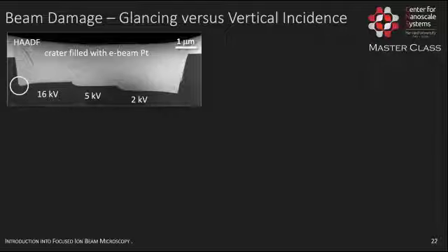Furthermore, you see now a white band closer to the edge, and with EDX we can confirm that this is indeed gallium implantation. And it turns out that when we are plotting and measuring the profile of the gallium distribution, this profile corresponds pretty well to what we are expecting from Monte Carlo simulations. With one little detail: you see a dashed curve and a solid curve.